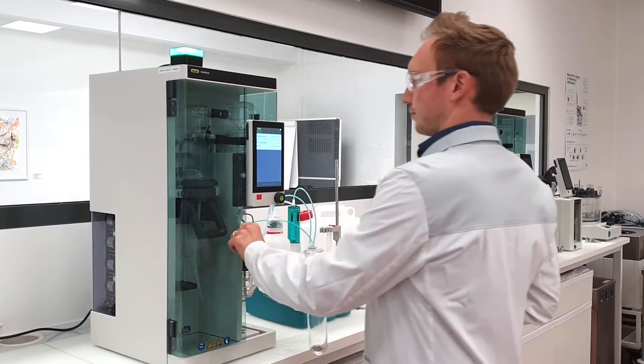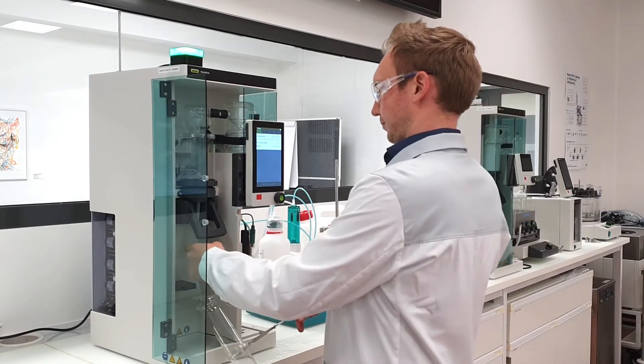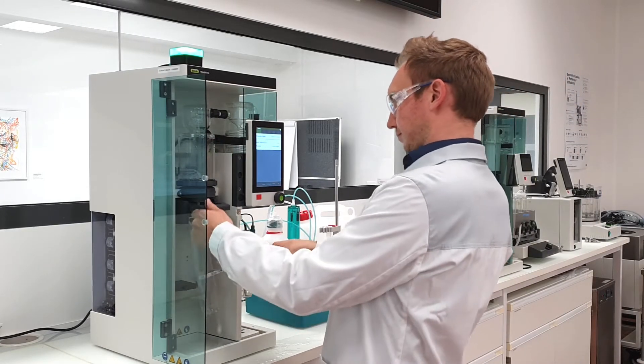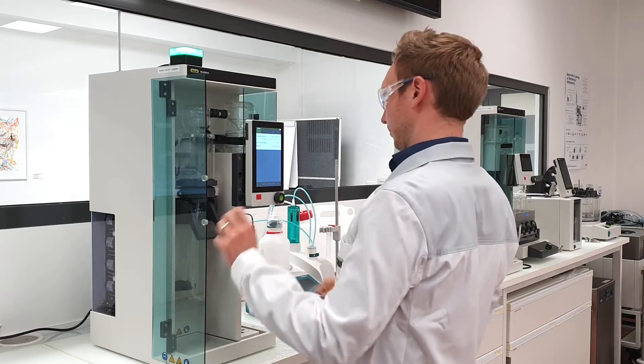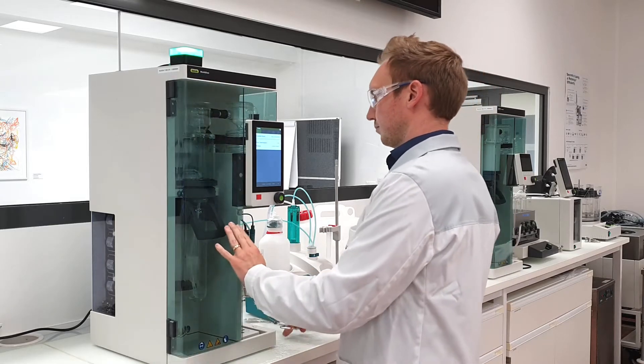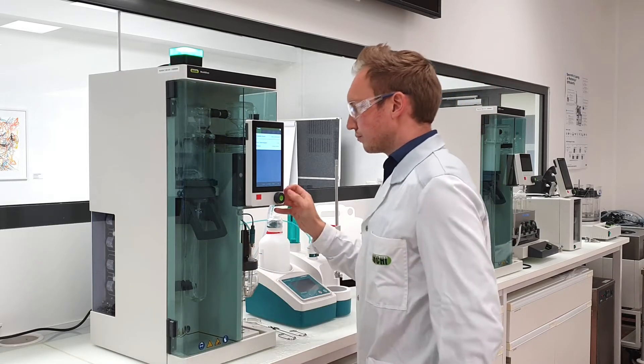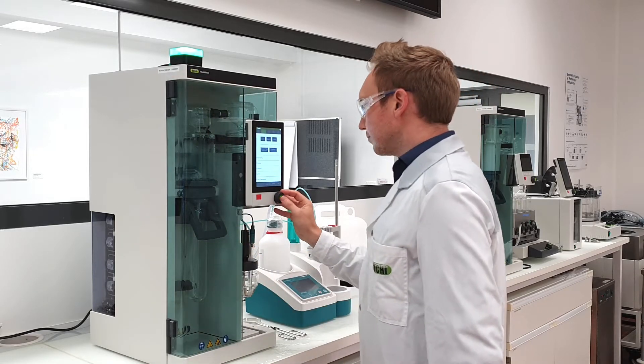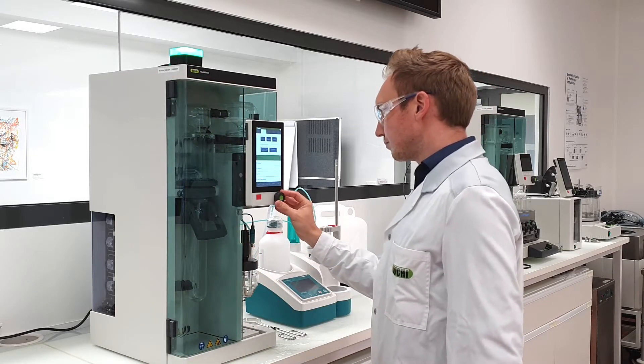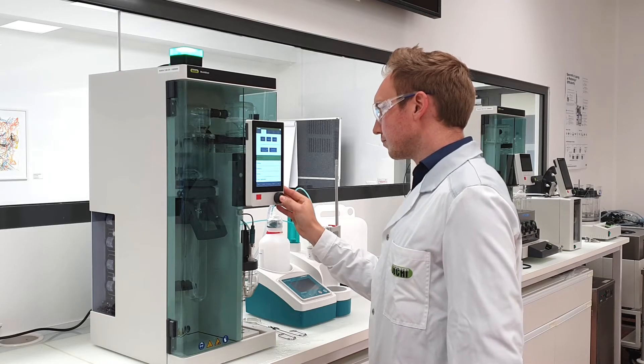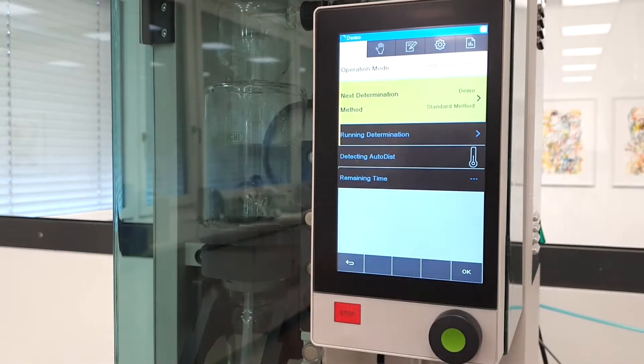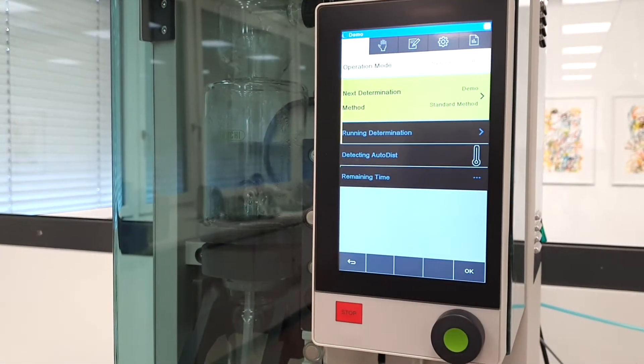It is of highest importance to protect the most valuable asset in the lab, our lab personnel. Therefore, we introduced multiple sensors that ensure safe operation according to the highest safety standards.